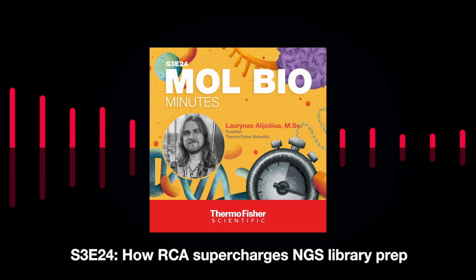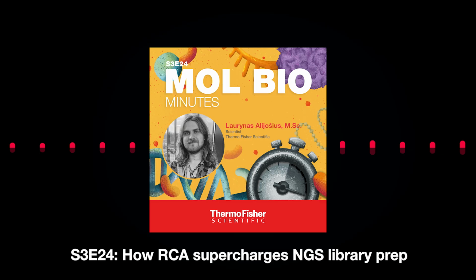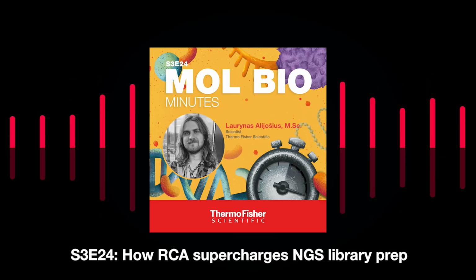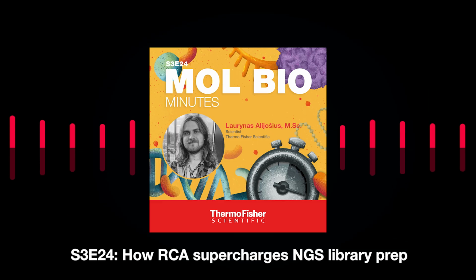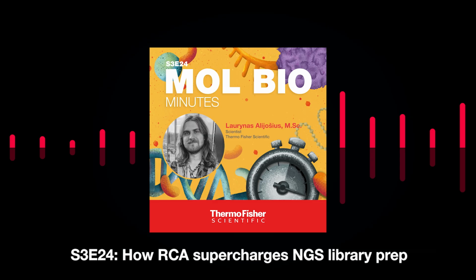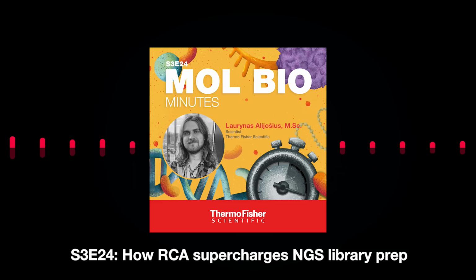So now we're going down the rabbit hole. All these terms right here, RCA, MDA, isothermal amplification. So it gets kind of confusing, right? So what is isothermal amplification then? And is it some amplification like PCR? Well, not exactly. Isothermal amplification is a bit different from PCR. It's more like a chill cousin of the PCR.